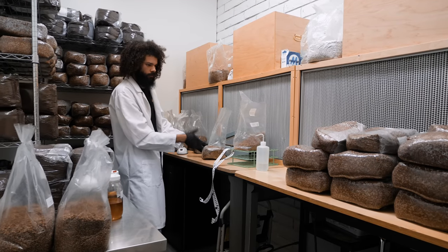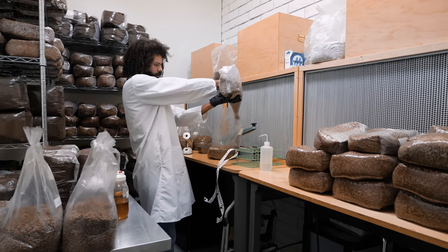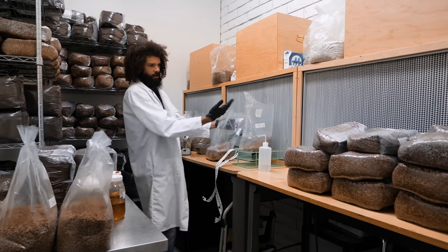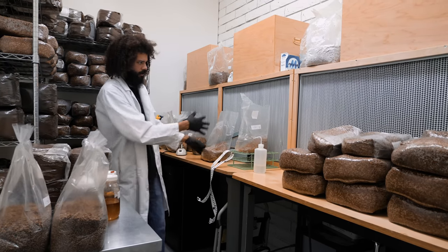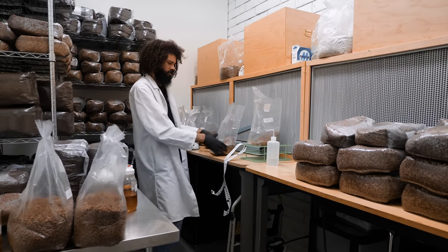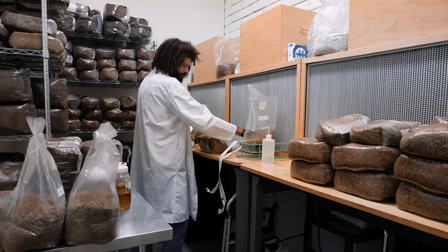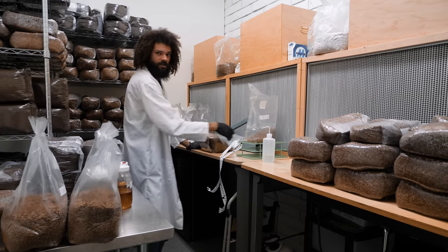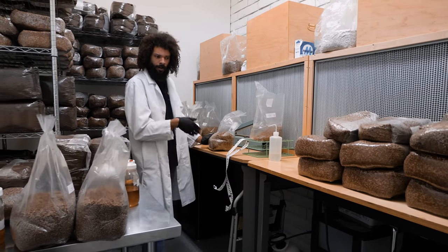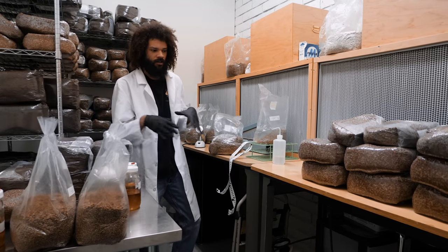You can see me using a lot of equipment, but when I was young and first started out, I'd use little mason jars as my spawn containers. Those enabled me to work without a flow hood — these big filters in front of me that provide a stream of sterile air. For years I didn't have any of this equipment. I started growing mushrooms at sixteen years old and would find things around the house to create a little sterile environment. My first glove box was a cardboard box lined with aluminum foil, two holes cut in the front, with long vinyl cleaning gloves taped inside, and a clear plastic film on top.